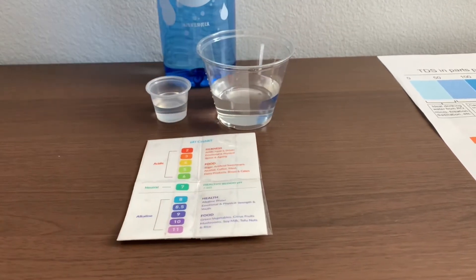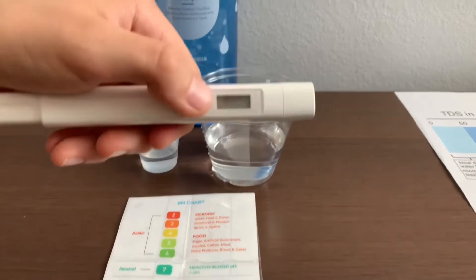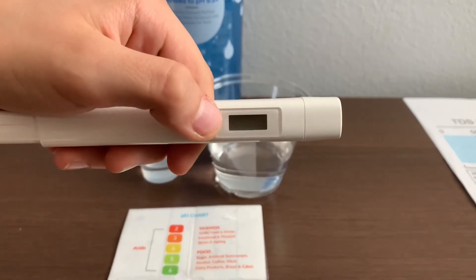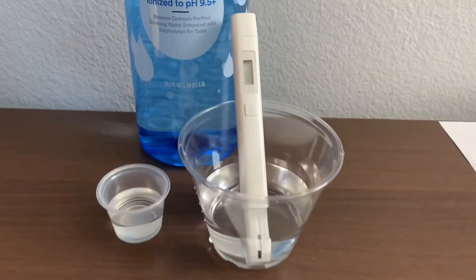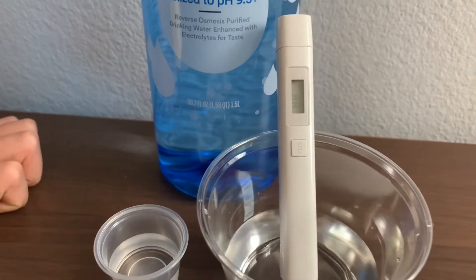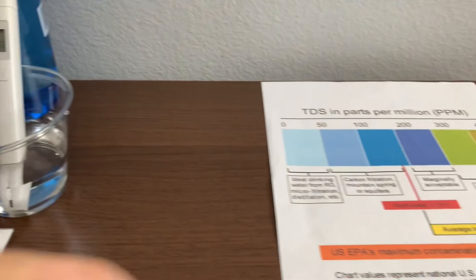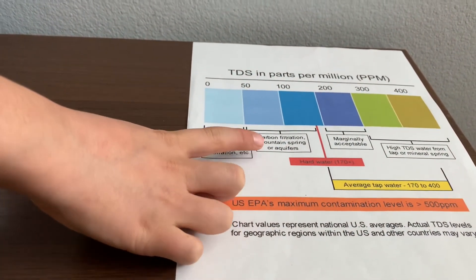First, let's test the TDS level. Turn on the TDS tester, make sure it says zero, and put it in. 87, 88 — that is carbon filtered mountain spring or aquifer level.